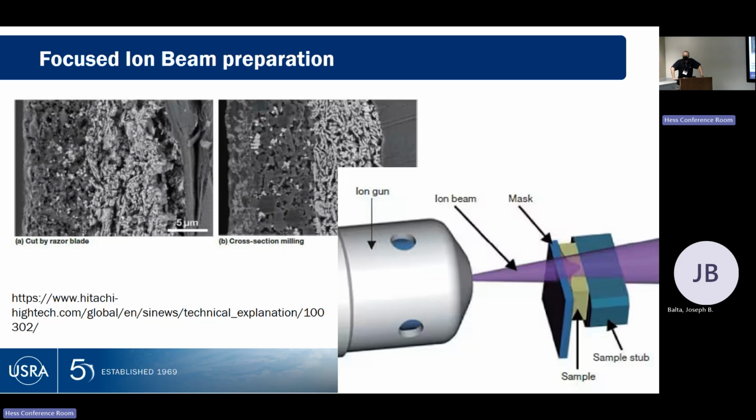These are not cheap. This is the definition of not cheap. So you've got an ion beam that you're firing inside a vacuum chamber to burn off a piece of the material, then grabbing that, moving it up to your sample stage, all while done under vacuum. You're not going to learn that in 4 days. Okay? If you ever have to do this, you know who's probably going to do this the first 10 times is going to be the lab manager. And maybe they'll coach you up for this on their specific machine. It's powerful. It's done. It's terrifying.